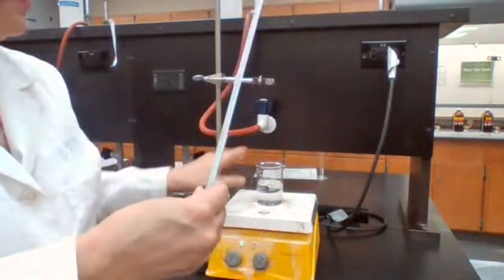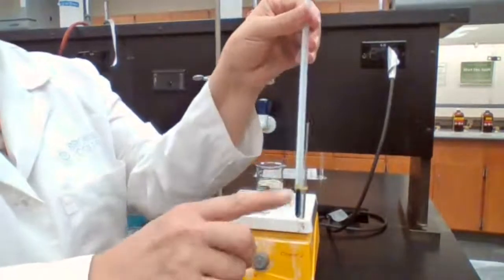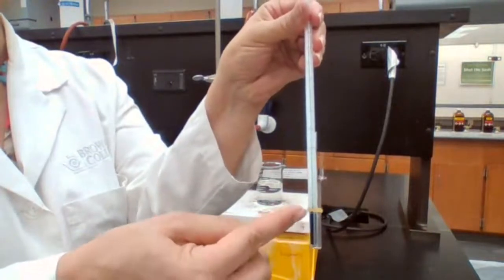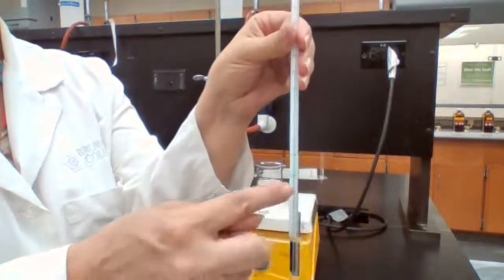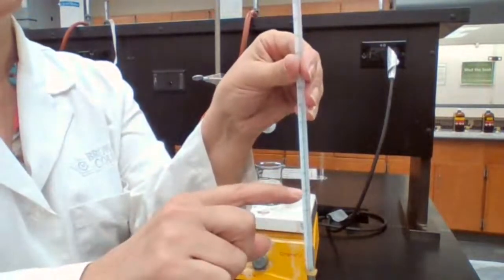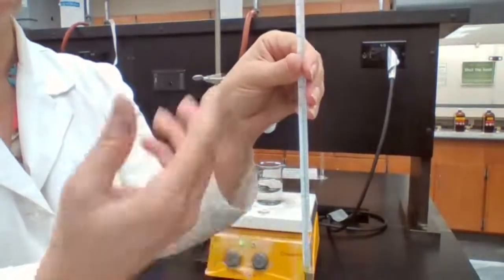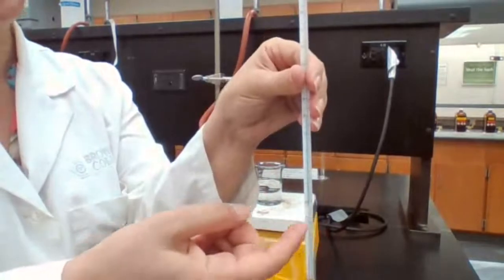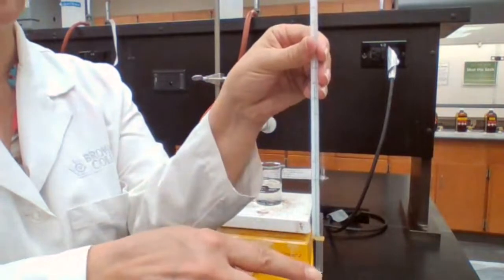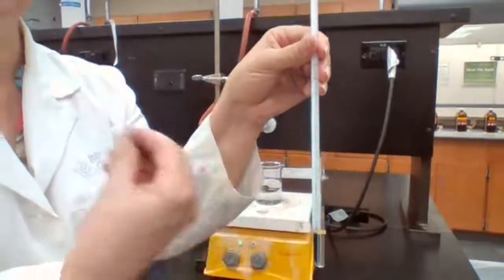Then I start heating up. When the temperature reaches the boiling point of the sample, you will see bubbles coming out of the capillary tube, because if the liquid boils, the liquid inside the capillary tube is going to boil also. Since the closed end is on top, the vapor cannot go out from the top of the capillary tube. The vapor is going to go out from the bottom side of the capillary tube, which is open, into the liquid. Then we see those bubbles coming out.